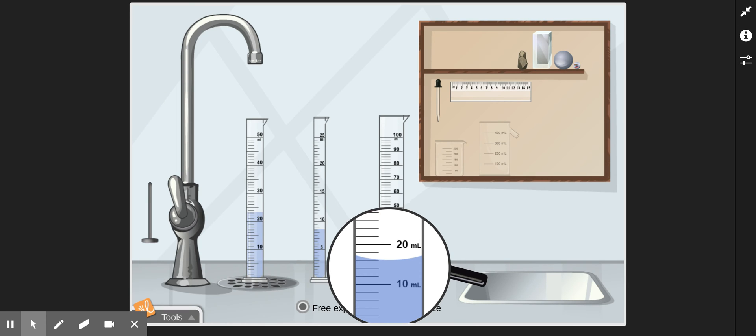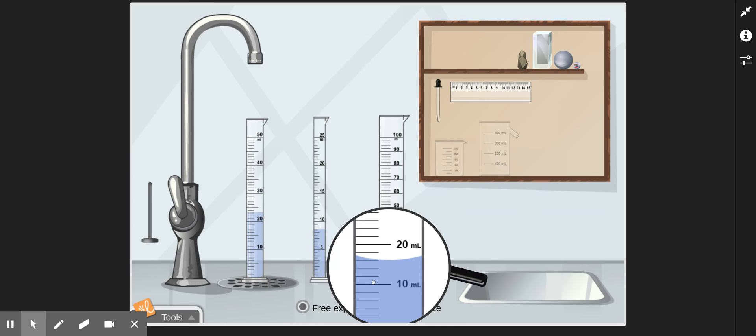When you're deciding how much or doing the calculation for how much volume changes with each line, always double check. Like, if I assumed incorrectly that these lines represented 1 milliliter, I can double check. It would go, if it was 1, it would go 10, 11, 12, 13, 14, and this line should be 15, but it's not, it's 20. So that tells us right away that those lines don't represent 1. So even if you can't remember that equation of the difference divided by the number of spaces, you can do guess and check.